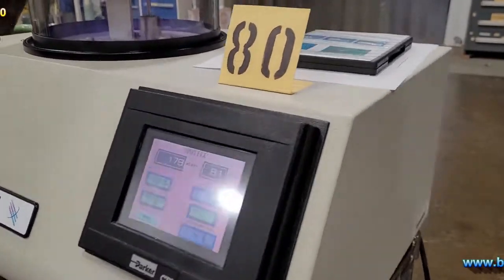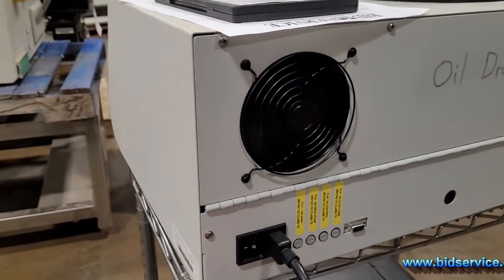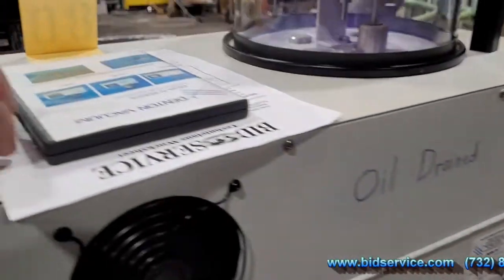On the back of the system, this has your power hookup, and then your gas. I have argon hooked up to it.